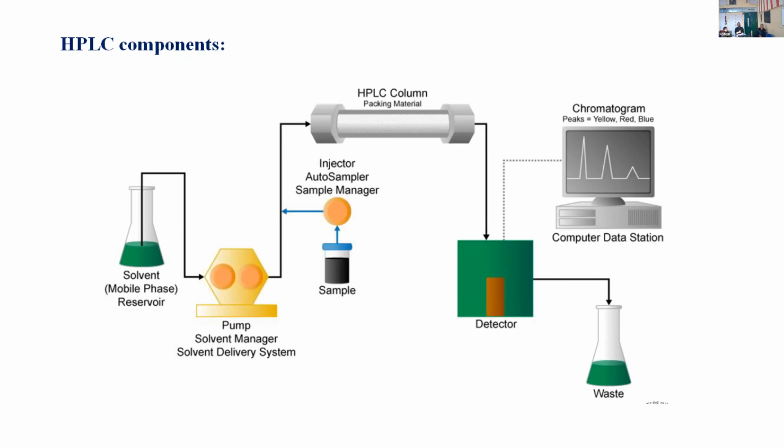So coming to the HPLC components, there are multiple components. First is the solvent reservoirs. In advanced machines, nowadays companies provide two or four solvent reservoirs, so we can use multiple mobile phases for the analysis.